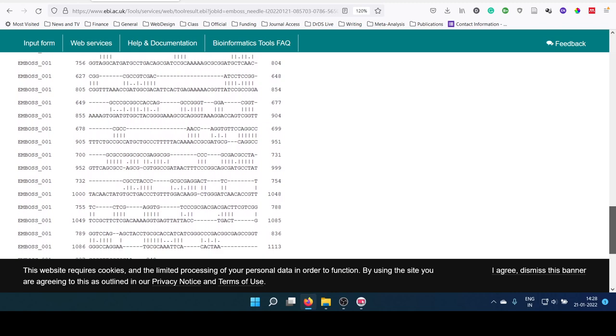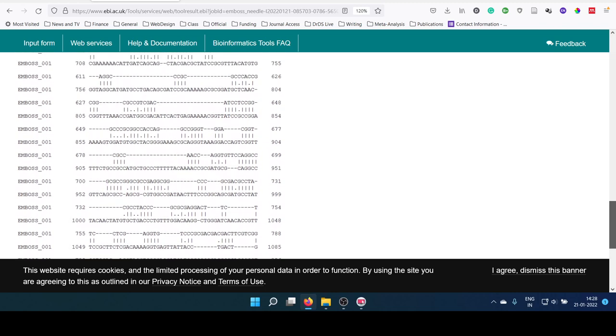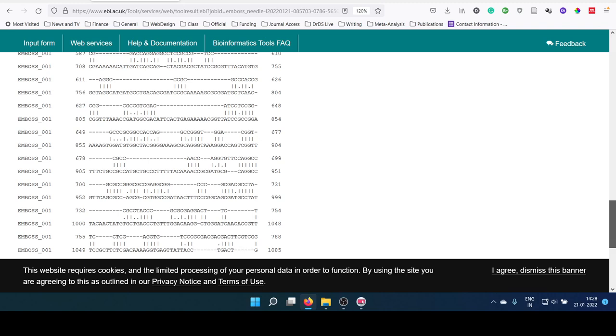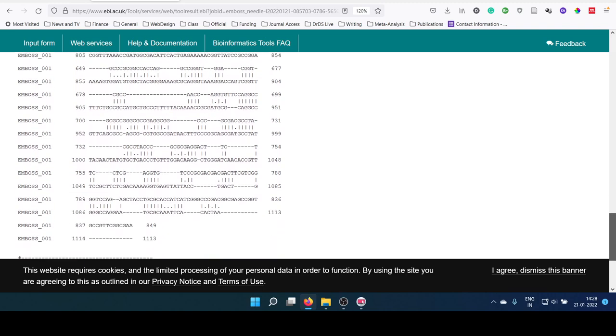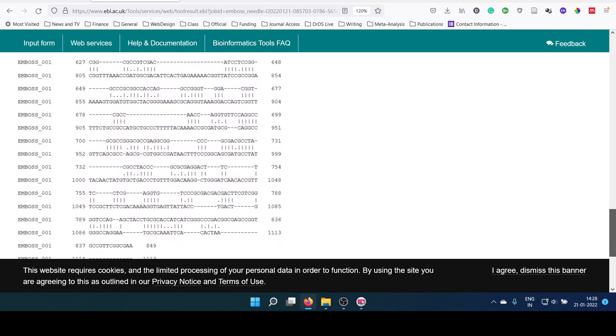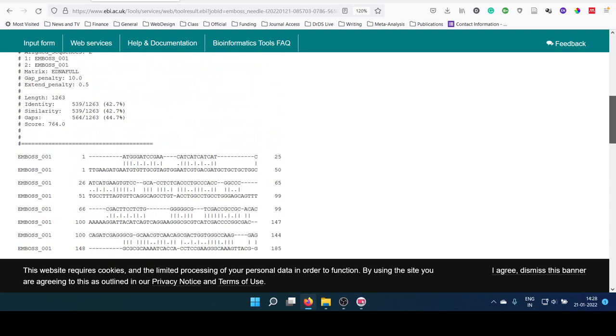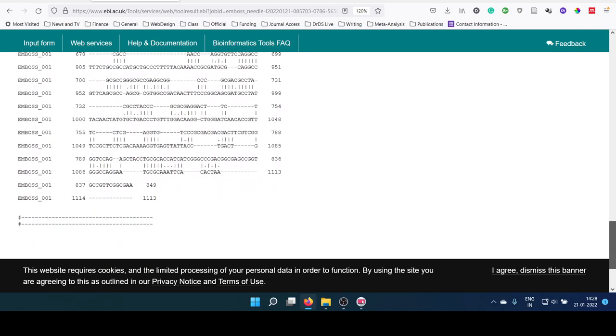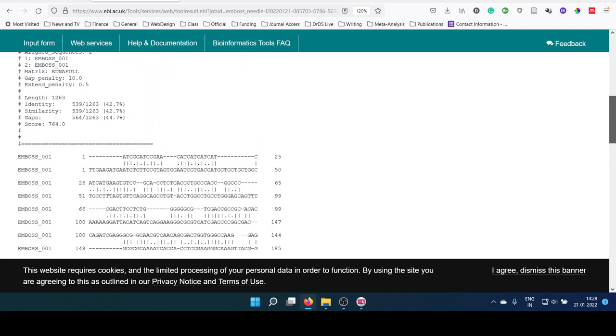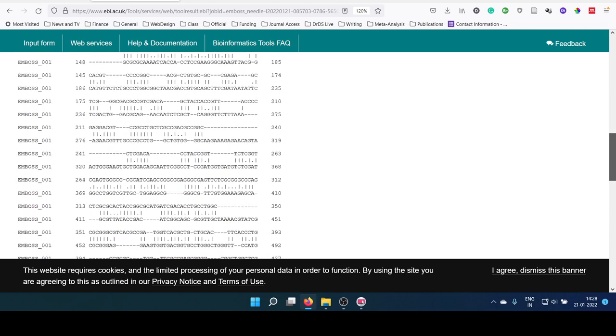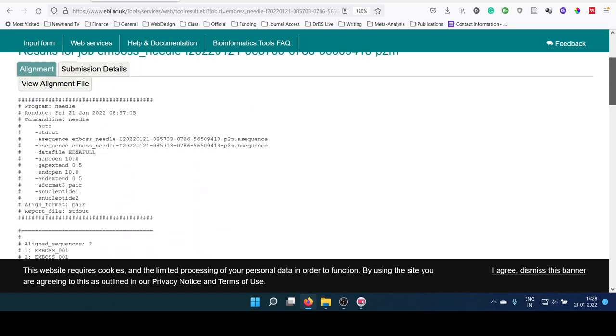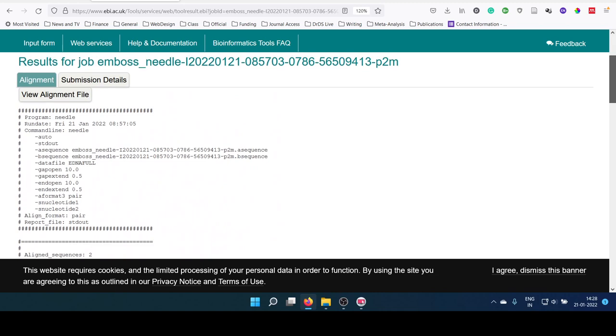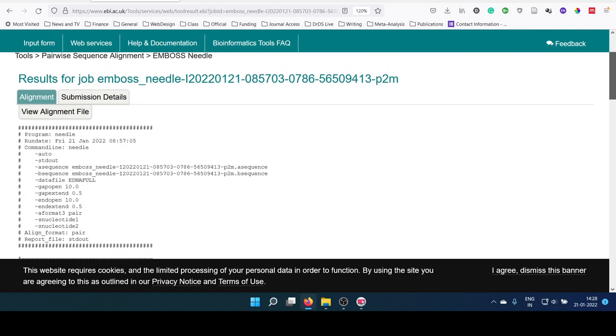The sequences were now aligned pairwise wherever the similarity is there, it is actually paired with the other sequence. Partial similarity and gaps were also inserted in between the sequences. This is how we perform a sequence alignment using Needle package of the EMBOSS.